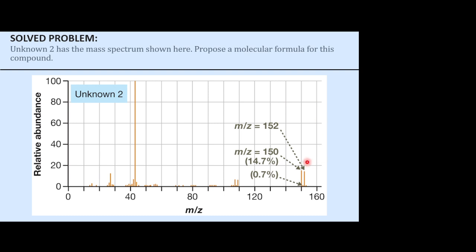But for the heights of these, if you look at something like a chloride, as you add more chlorides, you'll get more of them showing up in the isotopic ratio. So it'll make a small difference, not as much as the carbons did though, because the carbons are 1%, so you got a lot of room to grow. But yeah, you can use that same isotopic ratio for all these.